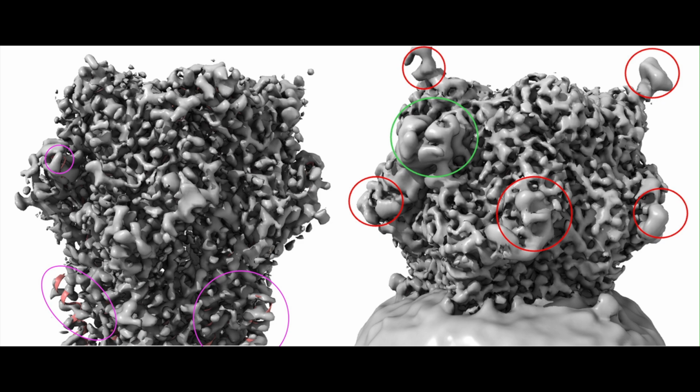So as I showed you earlier with the rotating receptor, that structure itself is what I put inside of the map itself, because in theory, the model of the nicotinic acetylcholine receptor and the EM density map we get should be the same. They should physically look the same, although the orientation of some of these amino acids might be a little bit different.